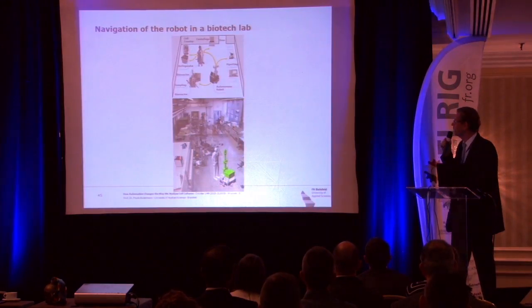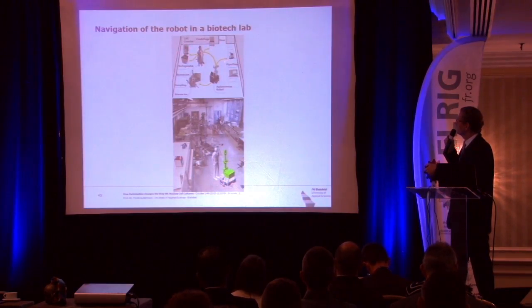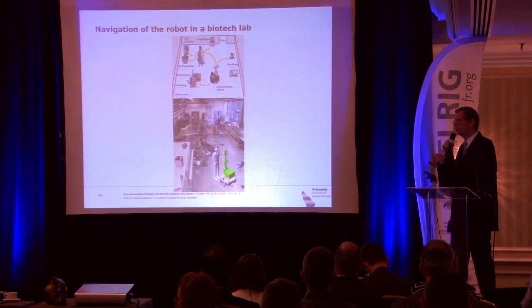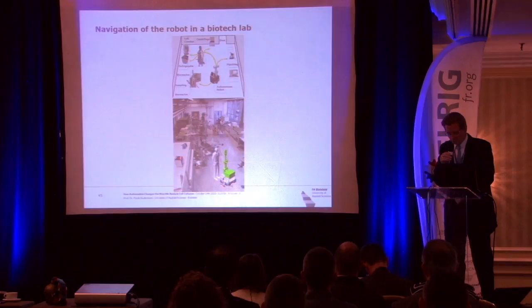Okay, so I try to start this now. Just for orientation purposes, we have a 20-liter bioreactor in the lab, a 100-liter bioreactor. This is the fridge. This is the centrifuge the robot will use, and the cell counter and the pipetting station. And I will show the task of getting a sample out of the bioreactor, then getting the sample cells into the sample cup, going to the cell counter, and then opening the centrifuge. I skipped the part of putting the sample into the centrifuge, so get the part out and freeze it. So that's hopefully what is coming next.